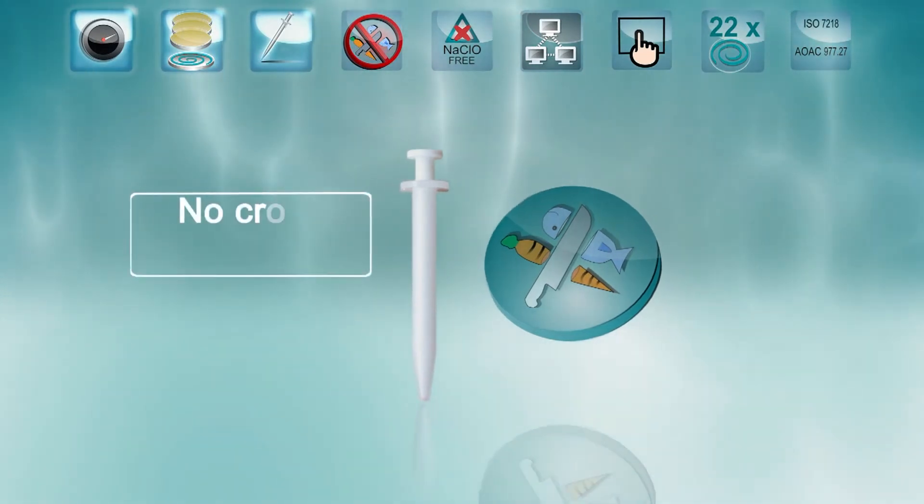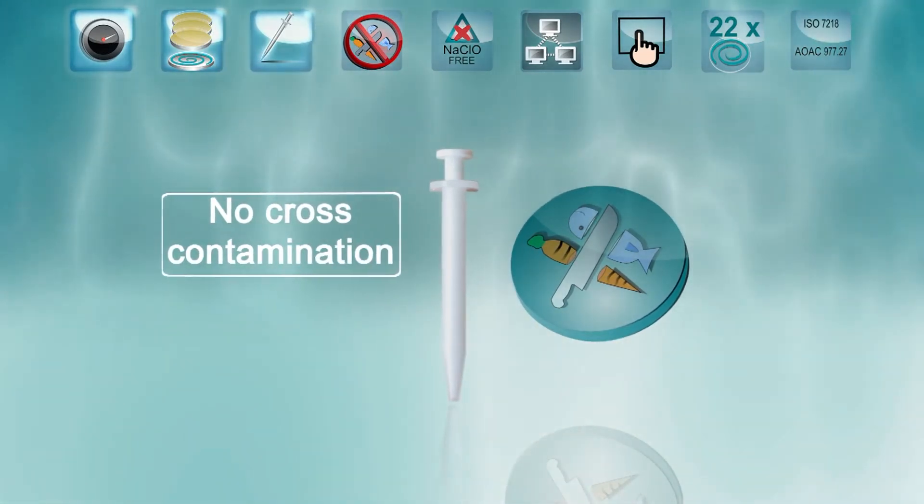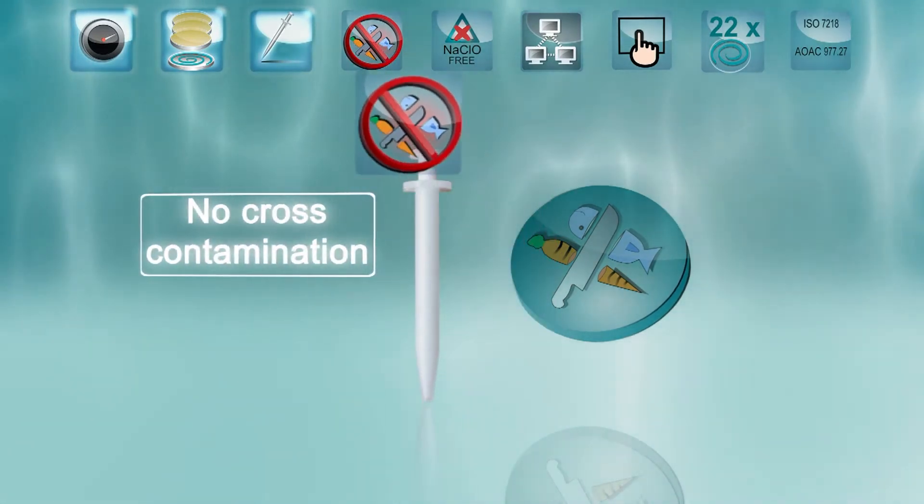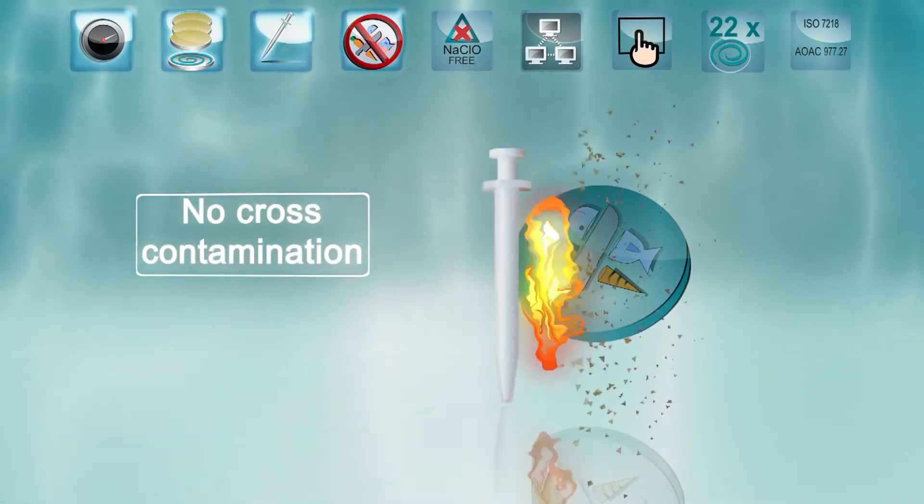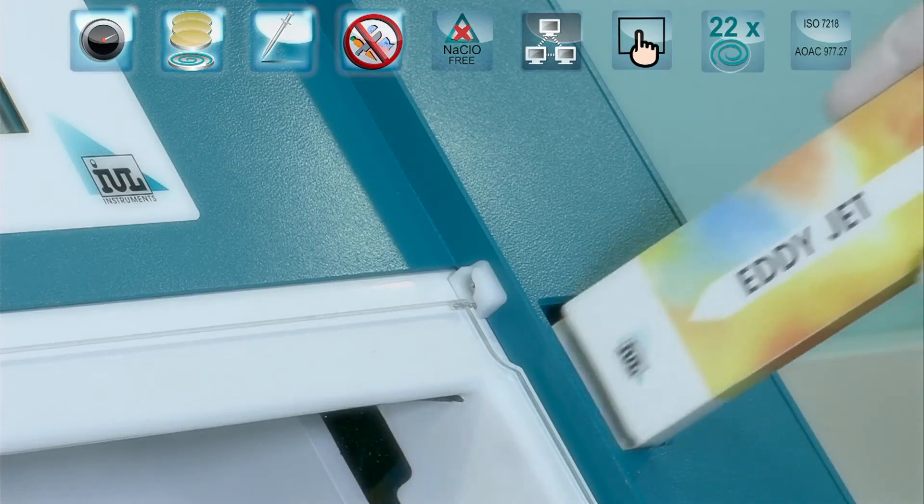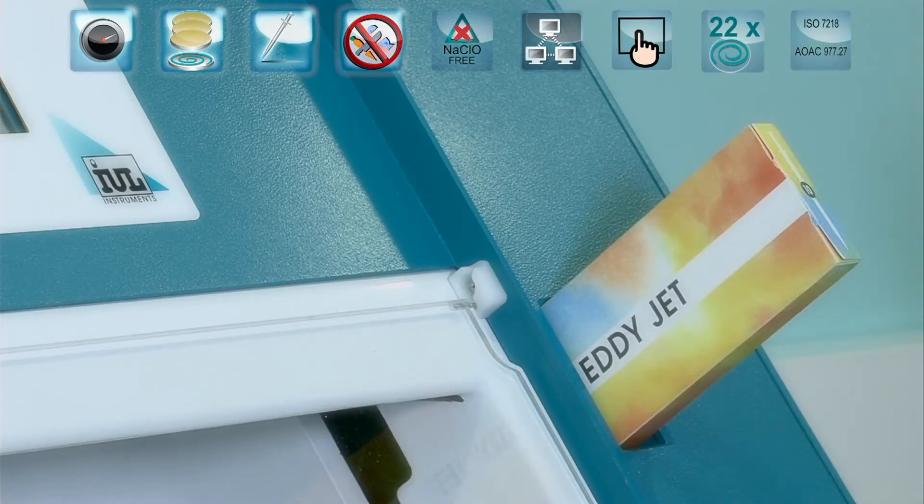IUL's world-patented micro syringes prevent any cross-contamination from taking place. This makes EDIJED2 the spiral spreader with the highest sensitivity. Gamma ray micro syringe sterilization makes cleaning cycles unnecessary, saving large amounts of time.